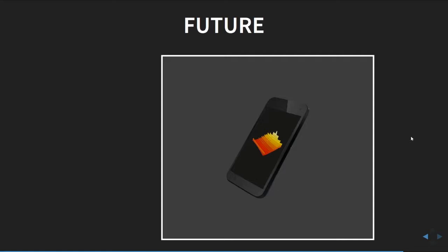Right, so for the future, I guess we wouldn't really want to add too much to it. I mean, we don't want to make it into an analysis program. We just want to have something really quick and easy where you can display data and see that it's there. But one thing would be to improve the mobile interface. Right now you can use it on a laptop or a tablet, or even a phone, but it could be better. I think, especially on a phone, I have not really worked on it at all.